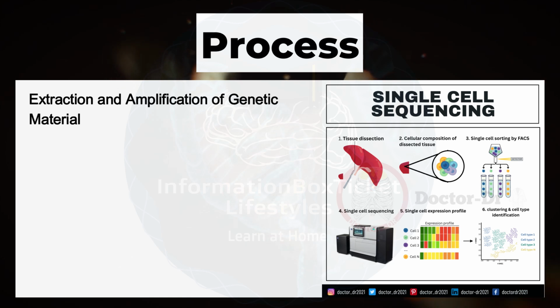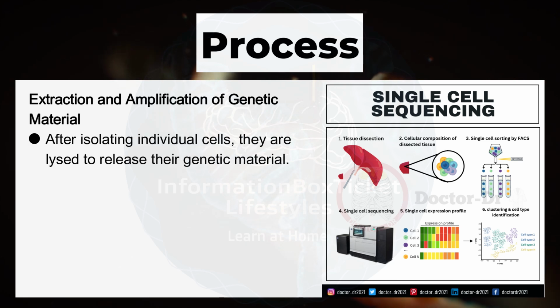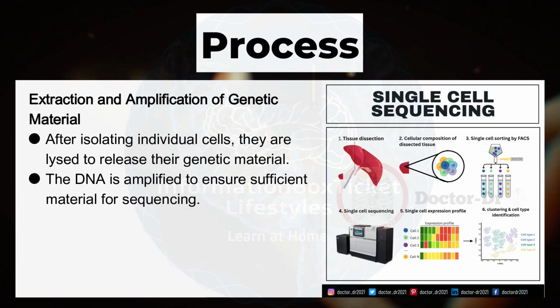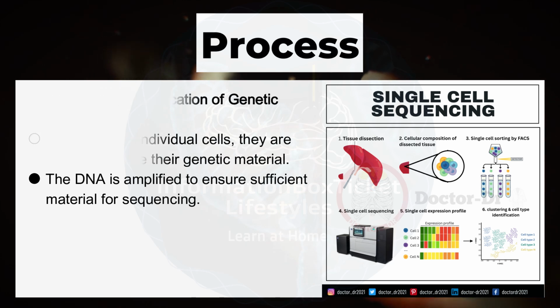Extraction and amplification of genetic material. After isolating individual cells, they are lysed to release their genetic material. The DNA is amplified to ensure sufficient material for sequencing.